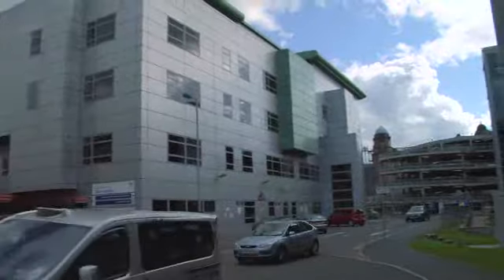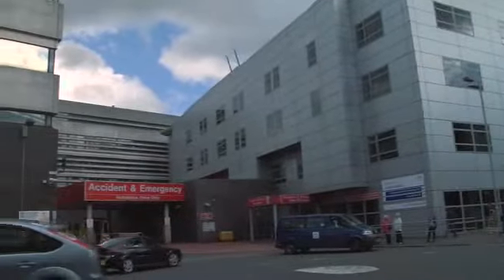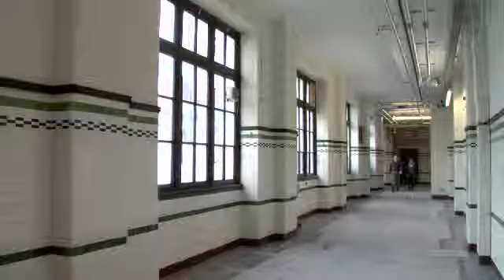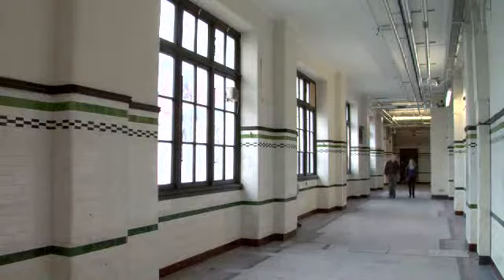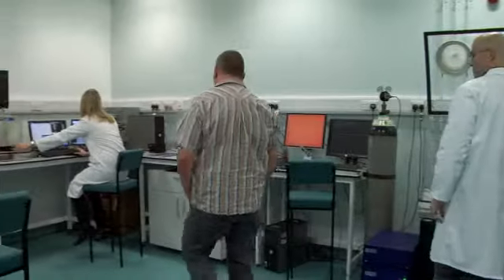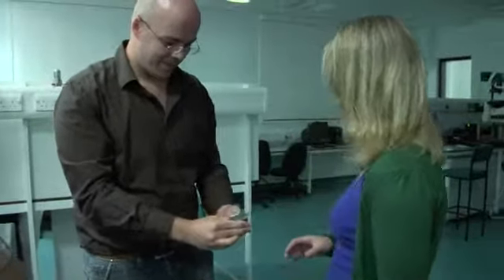This could really push forward diagnostic procedures and let us sort of pinpoint what's wrong with the patient quicker than we've ever been able to do before. So something that we've started working on now and is a real thrust of our research is to try and take the chemistry from the bench into the body or from the test tube to the cell. By using new tools like DPN systems to work on a nanoscale, scientists can better understand our basic building blocks. There could be huge impacts if the research keeps continuing the sort of way it is. It's quite exciting and quite a dynamic environment. It's quite a responsibility to think that the work that you do can make a difference to people's lives.